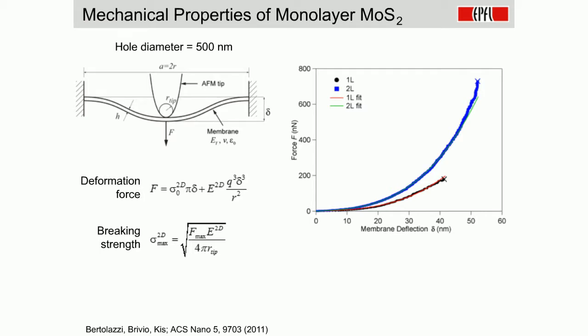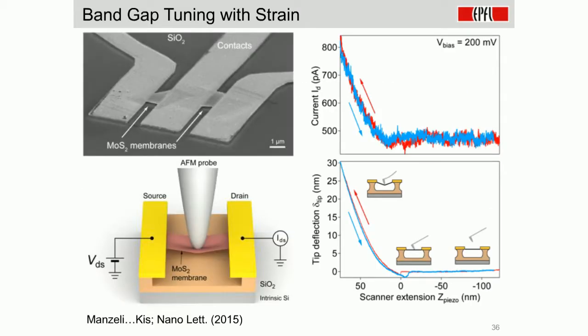There were a lot of optical studies that looked at this, and we decided to look at it from the point of view of electrical measurements. So we used the atomic force microscope again to perform electromechanical measurements, where we combined mechanical straining using the atomic force microscope together with electrical measurements to extract more useful information on the physical behavior of 2D materials.